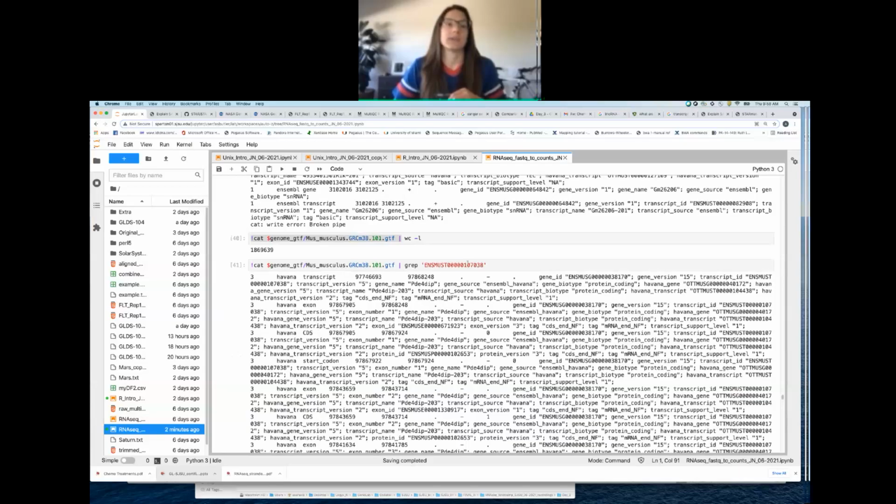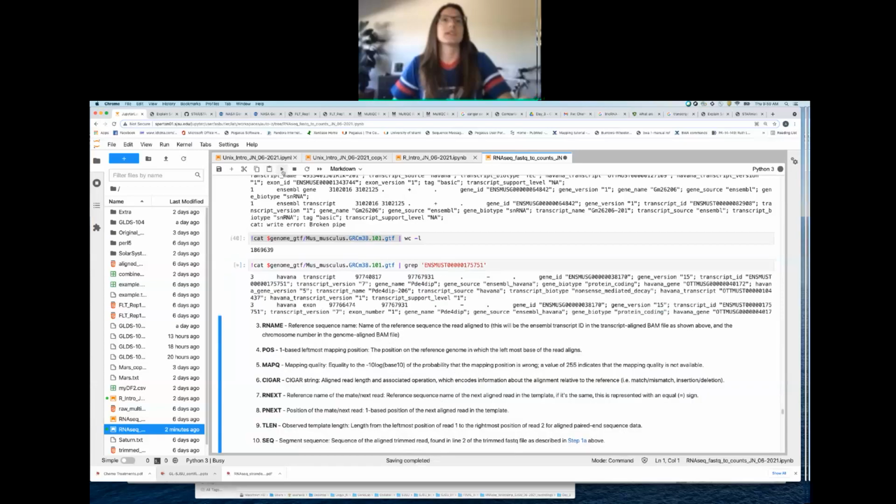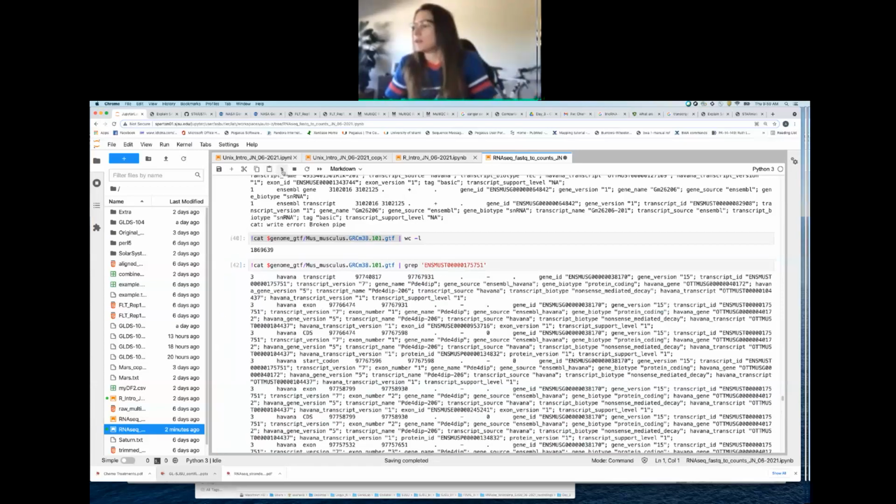Christina says, I can't get the cat command. Oh, just got it. Perfect. Sometimes it takes a little bit, especially because we're all running the same thing here. This is looking at that next transcript. And again, we're going to look to see if it's the same gene ID. So go ahead and press play. And indeed it is.